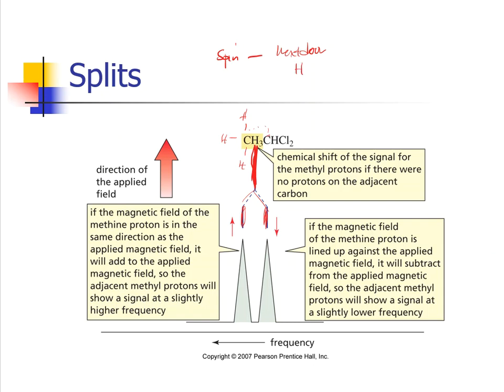So we talked in the very initial stages of the NMR videos about this idea of an alpha and a beta spin, or aligning with the field and aligning against the field. So what will happen here is that proton's got a choice. That proton can align with the field or it can align against the field. We get different spins that are happening from this as well.